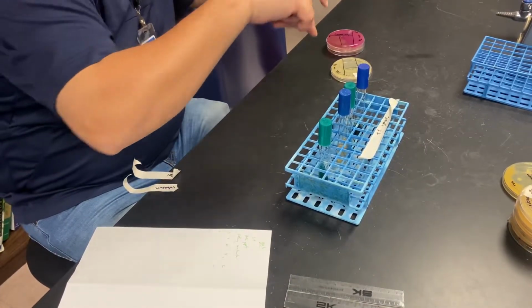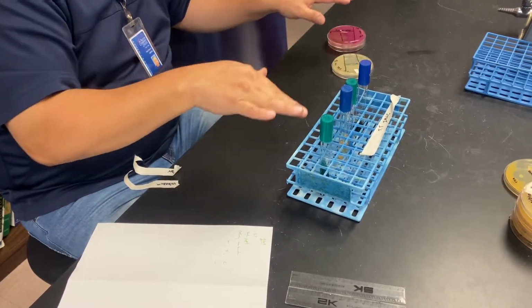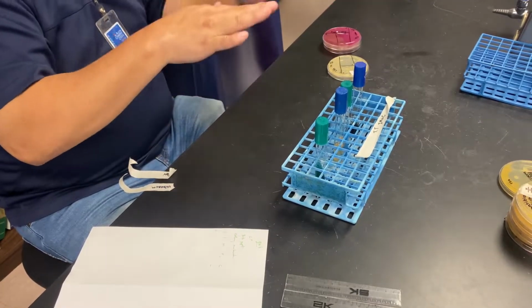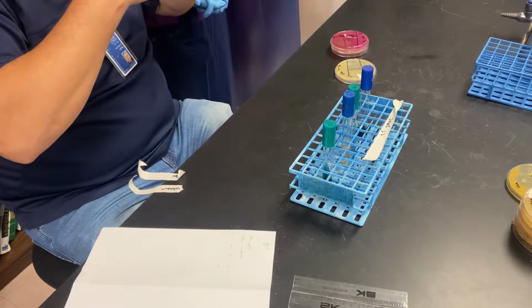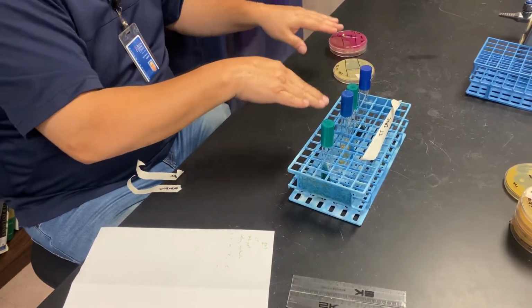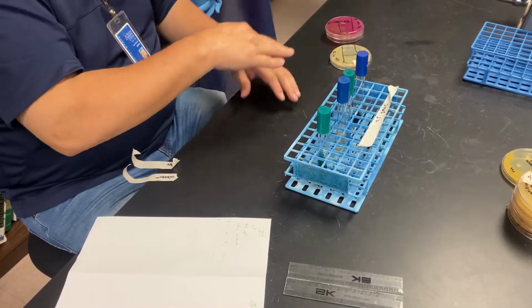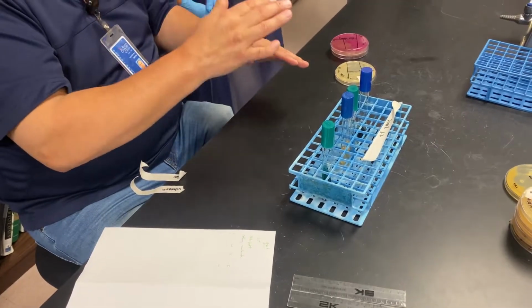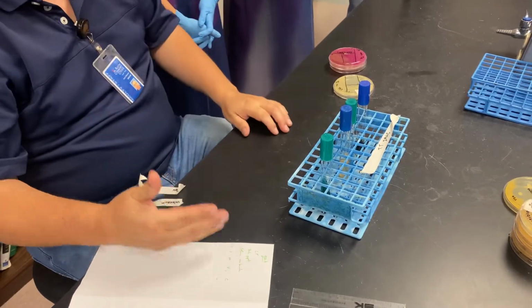Now remember, these two things don't make sense because they're two different groups. I'm just using these as an example. So you can't go, oh my God, he's got a lactose fermenter that's H2S positive, it's Citrobacter, that would be the answer. But these are not the same. Are you with me? These are two different setups. I'm just trying to get you to understand how to get this done. Okay. Now, that's what I have for my gram-neg.